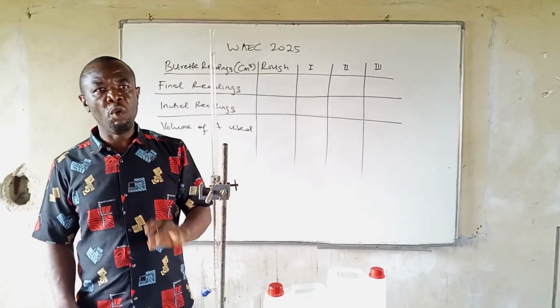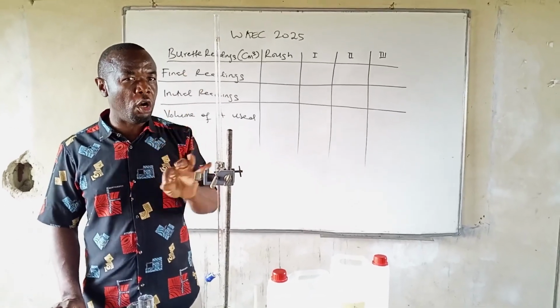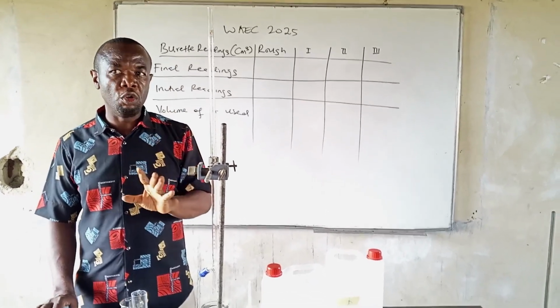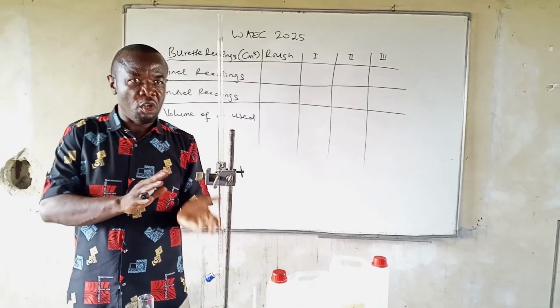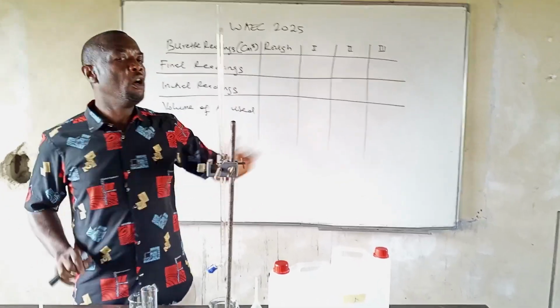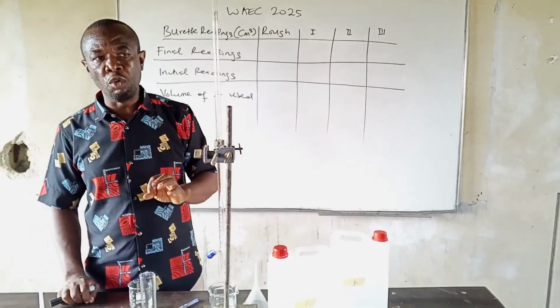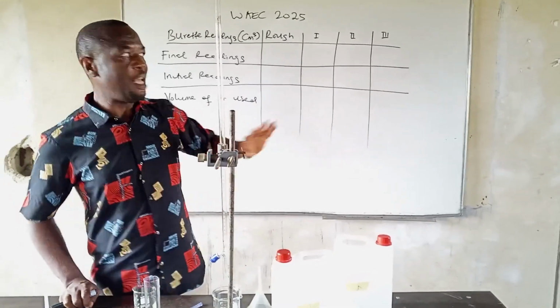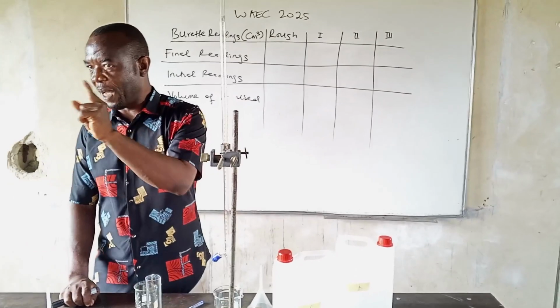At the end point, we look at some calculations. We're going to look at 4 different calculations, so we have to be very fast about this video. 4 different calculations to show how you can ask questions on this particular specimen. Questions can vary, so we're going to look at 4 different areas. Then after that, we're still going to look at the errors you encounter on the table, because the table is 8 marks for each examination.